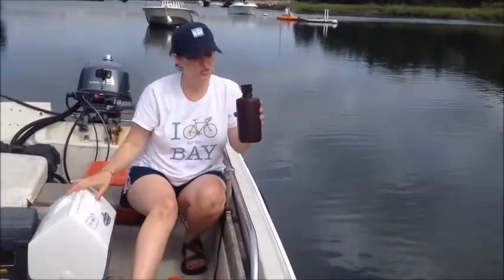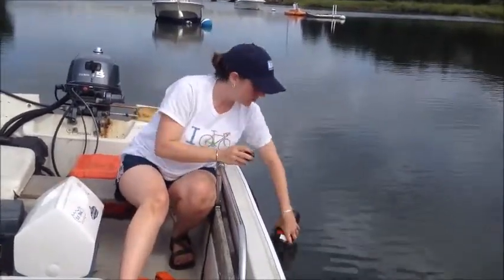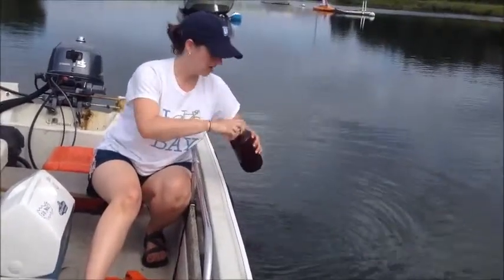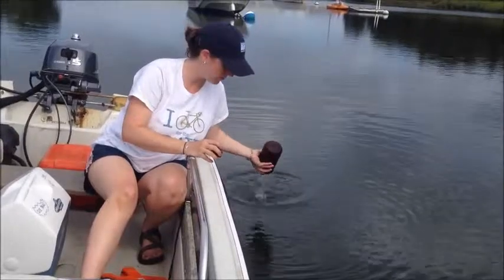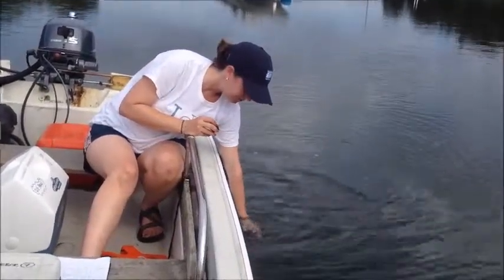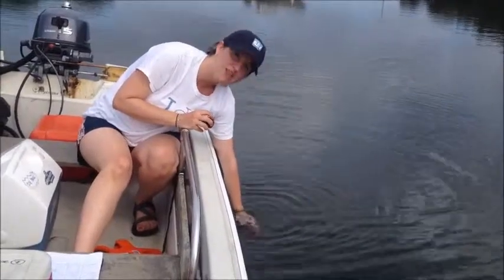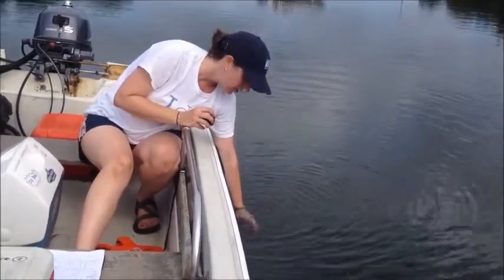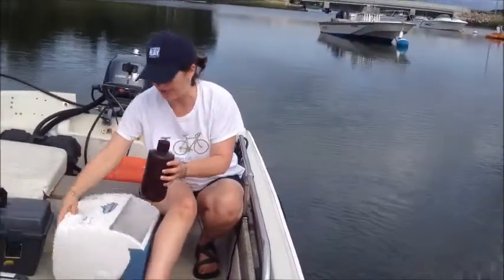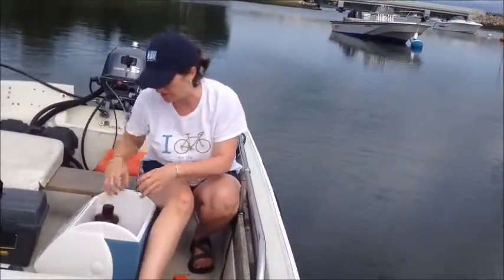We have 2 bottles for each station. We put the bottle in, fill it up a little bit, give it a rinse, get out any last wash water that's in there, and then we're going to fill up the sample at about 0.15 meters depth. We do this for a dark bottle and a light bottle for each station. One is to measure algal pigments and one is to measure nutrients.